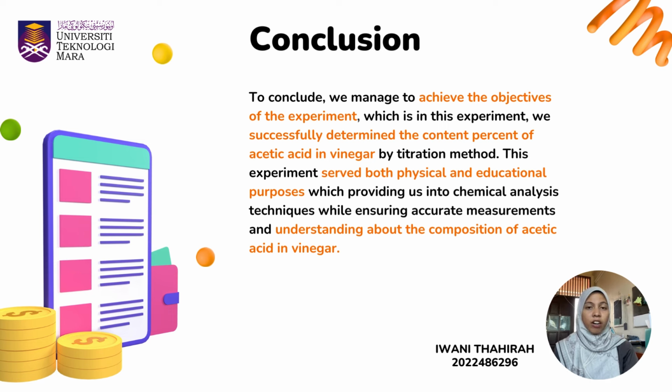Besides, the educational purpose is that the experiment exposes students to skill development, precise measurement, handling apparatus correctly and safely, and also applying mathematical calculation to real-life scenarios.